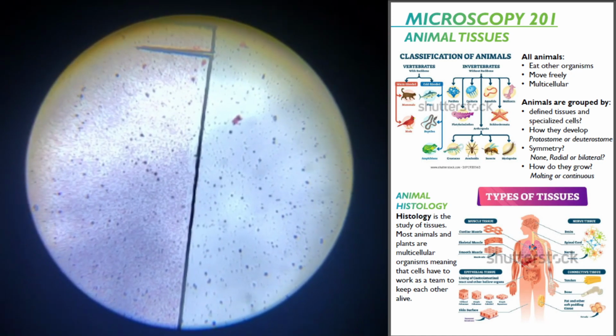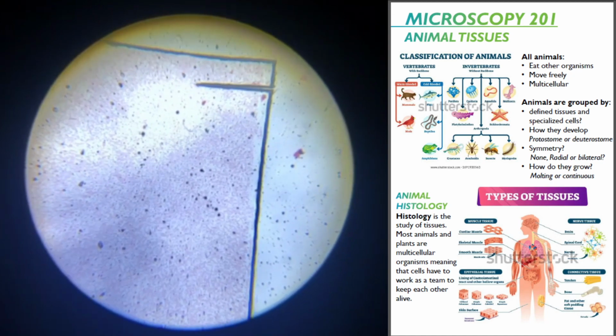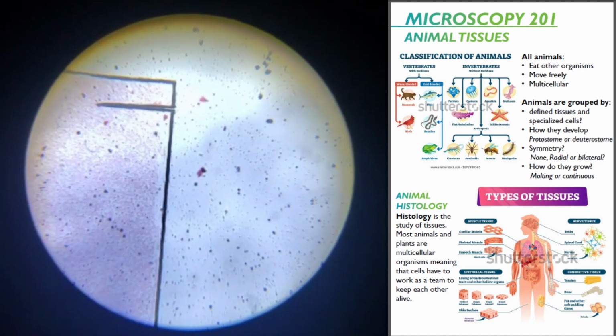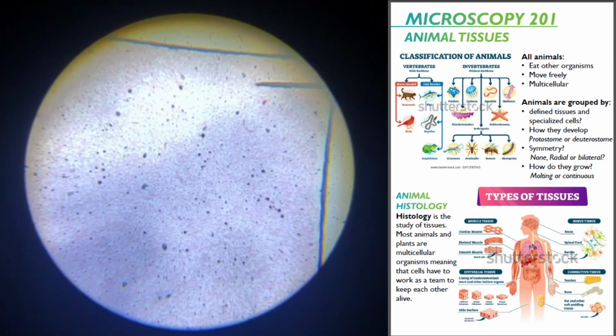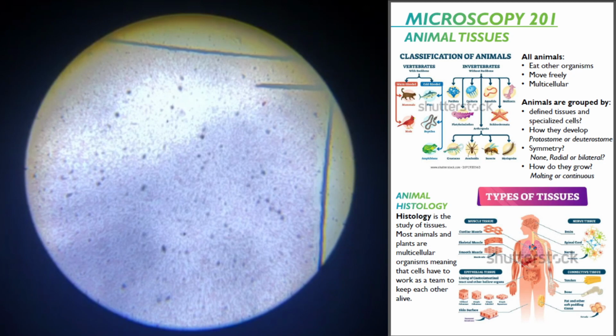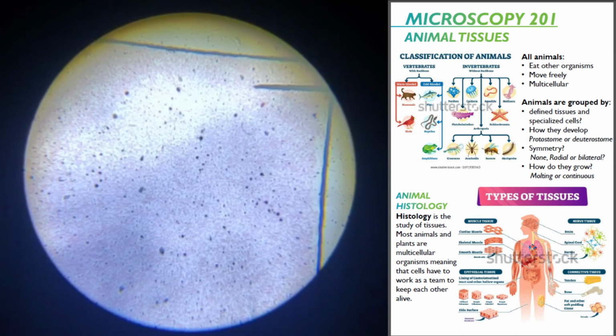When I do a blood smear, I don't get it square and perfect like that. They must slice it off with something, like make it into a gel sheet or something and slice it. You may think that's blurry and you're looking at the wrong thing, but you're actually looking at the right thing. Okay. So I'm looking at that square patch. I'm going to try and get it as clear as I can. Yeah, it's less than perfect. In fact, it's a little bit dirty.